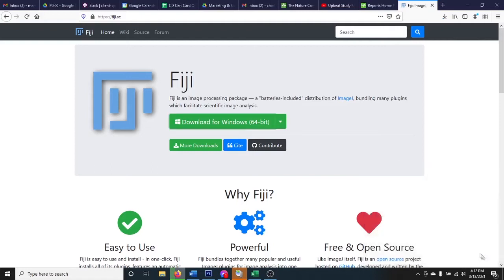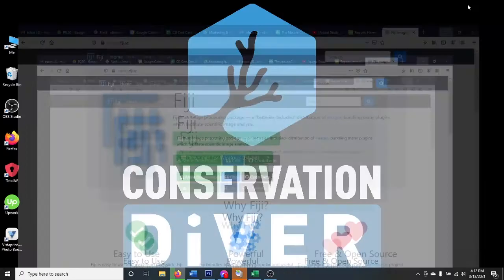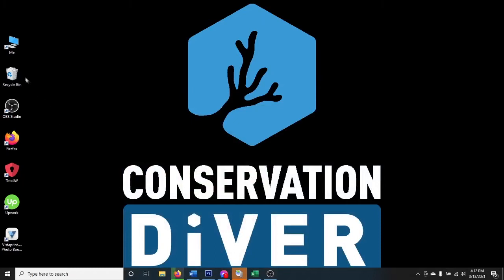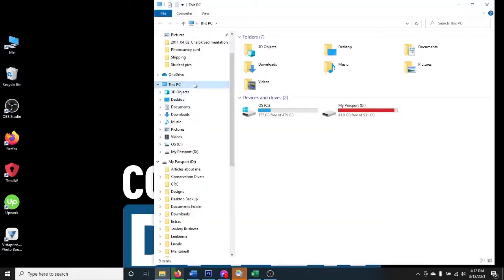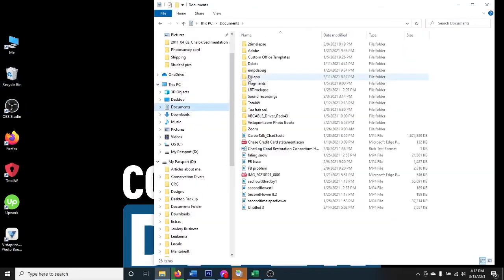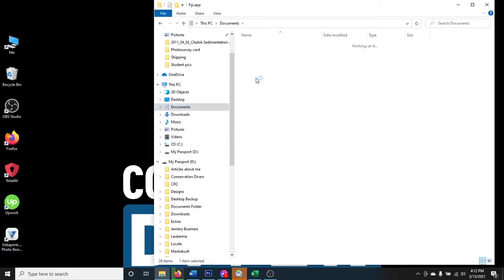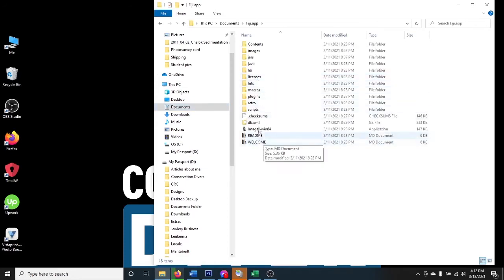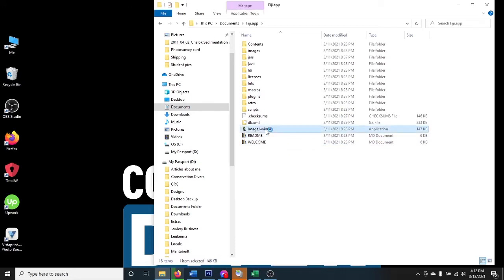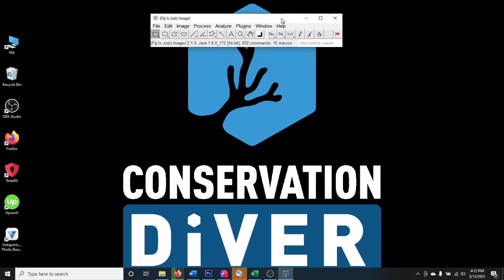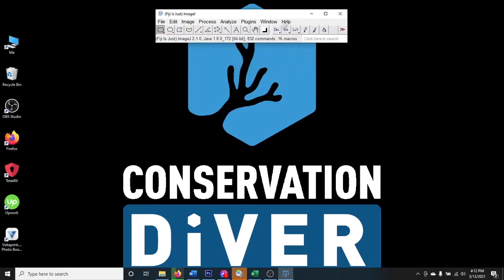You don't actually have to install it — the program will run right out of the zip file. I'll navigate to mine now. I have the Fiji app folder here, already extracted, and I can start it up right from here with the ImageJ Windows 64 application.